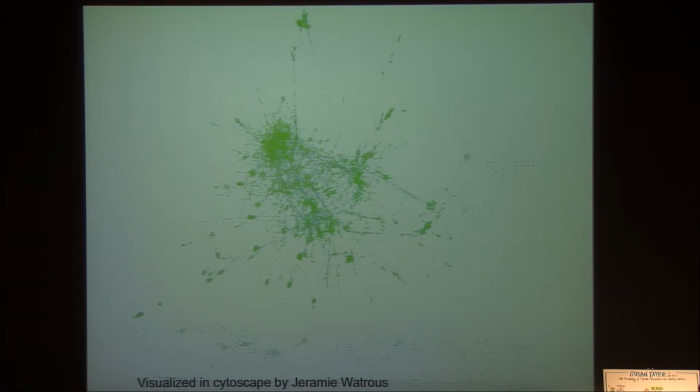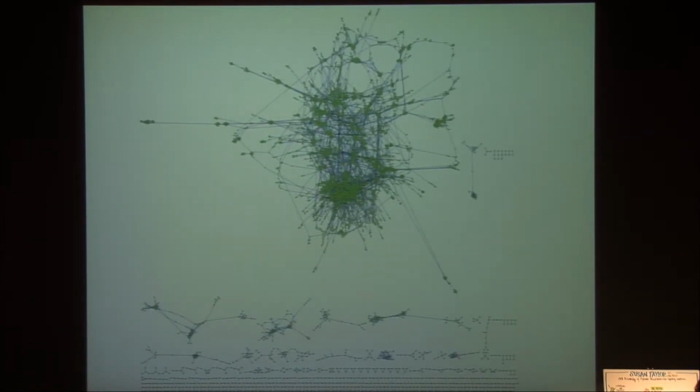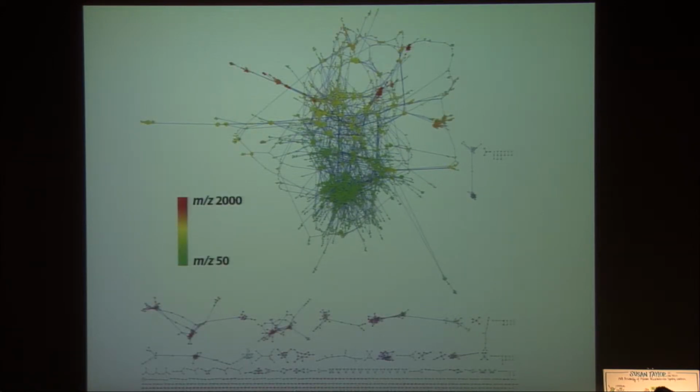In this case, every single node, if you get a cluster of these nodes, represents structural similarity. Once you have an optimized map that you're satisfied with, that you think you can pull out some chemistry from, you can now begin to add different attributes. You can add activity data. Here we show the intact mass of the molecules that were fragmented, and you can see nice correlations.